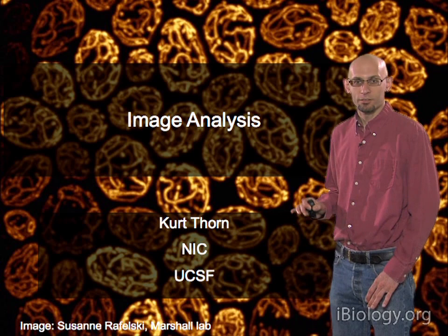The other thing that thresholding does is it gives you a binary image out. It's 1 inside your object and 0 everywhere else in the image. And so of course this can be used to identify objects. You just find all the things that are 1. But this can also be manipulated to further separate or define where objects are.